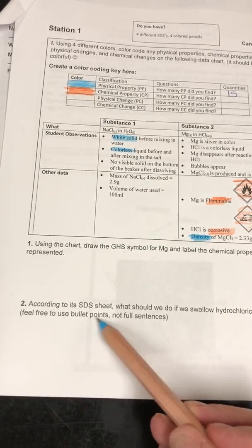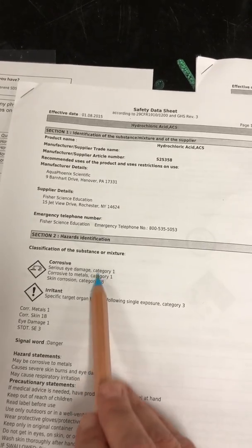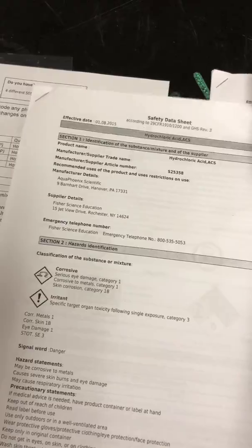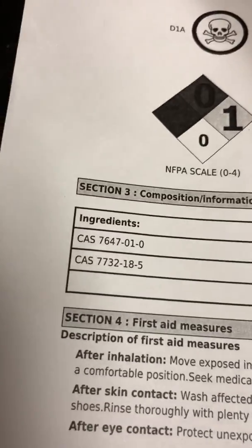According to the SDS sheet, the safety data sheet, what should we do if we swallow hydrochloric acid? Okay, so you're going to find the hydrochloric acid SDS. You are going to go to the section heading that you think will tell you what to do if you swallow it. Probably first aid. There we go, first aid. And you would look for what to do if you swallow it. Okay, that's pretty much that for that. So then we're going to go to station 2.